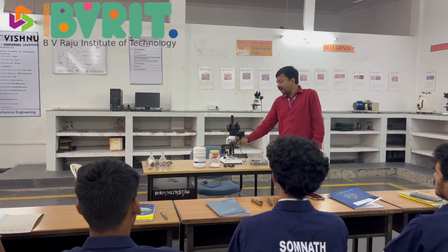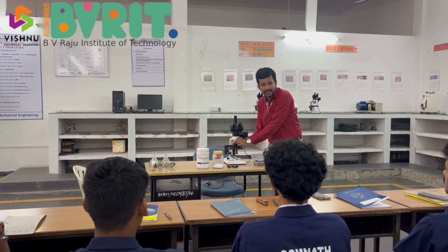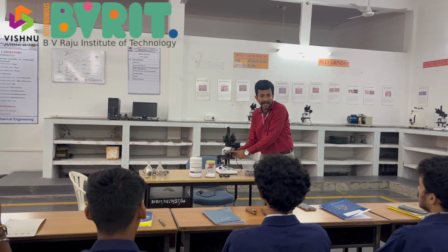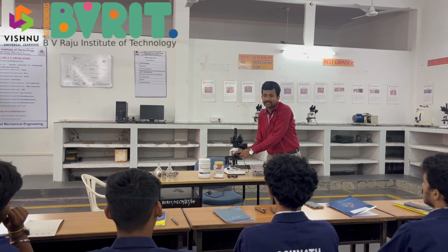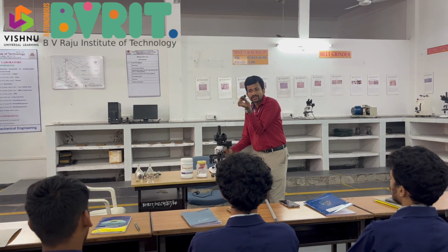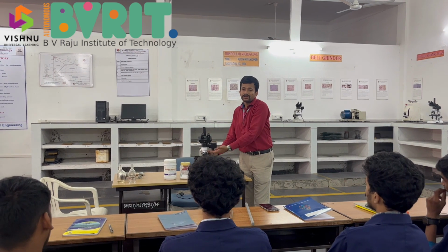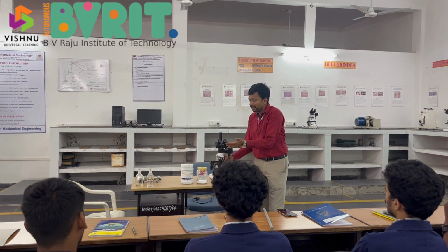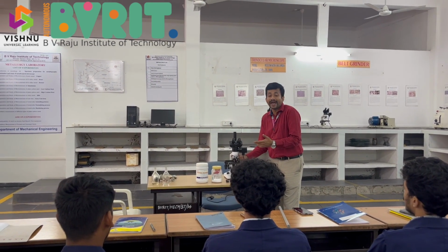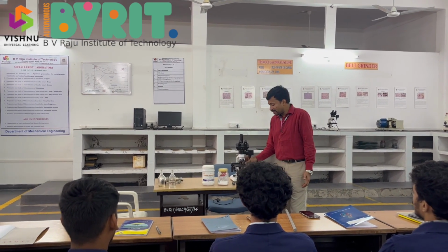So you have a pair of lenses here, which is a specimen objective lens. You can modify it as per the resolution, so the magnification that you want. That magnifying factor you need to multiply, and then there is a pair of eyepieces. This also gets multiplied, and then the objective and eyepiece together will give you the respective magnification number. But again, coming back to the same question, what is the problem?